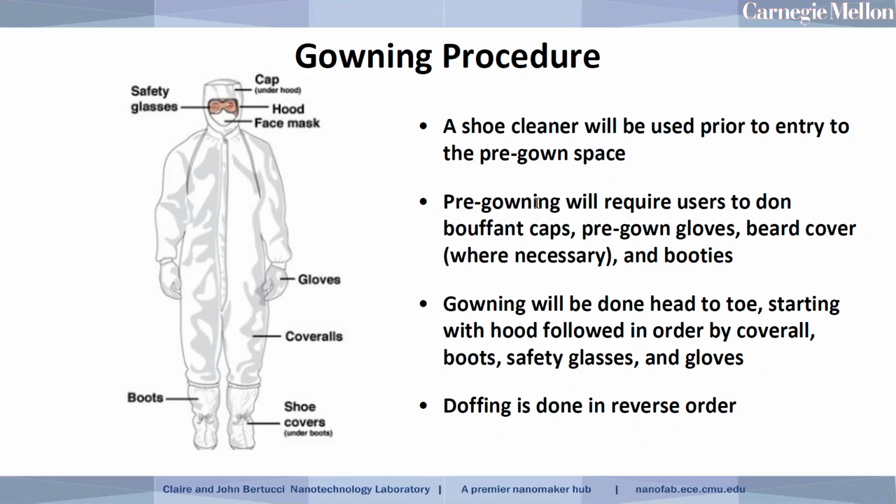So we talked about using the shoe cleaner. We talked about the pre-gowning components.